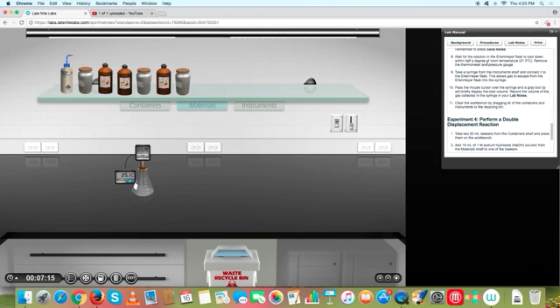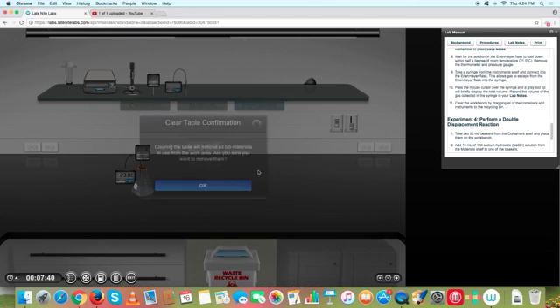Once this is done, it says wait for the Erlenmeyer flask to cool down, 21.5, remove the thermometer and the pressure gauge, and then you can continue on with the rest of the experiment here. Alright, so I'm going to clear off the bench. You can handle the rest of that. The syringe is in the instrument section. That's the one they're talking about here. Alright, clear the table.